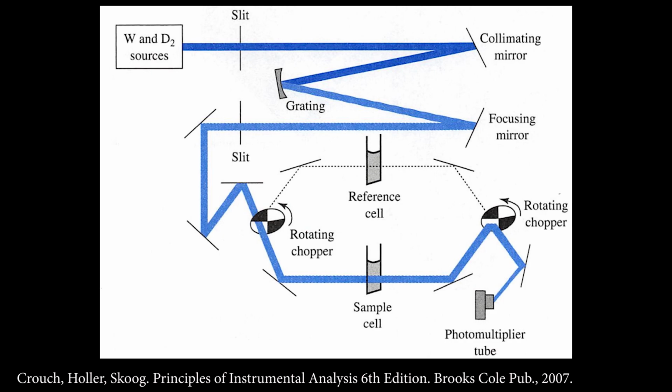There's also focusing. Instead of bringing the light into a nice formed beam, it's going to focus it to a specific point. It's going to have what's called a focal length, so it focuses to a specific point at a specific distance from the lens or the mirror. Again, you can have focusing lenses or focusing mirrors, where the light passes through the optic in a lens, or it's reflected off of the optic for a mirror.